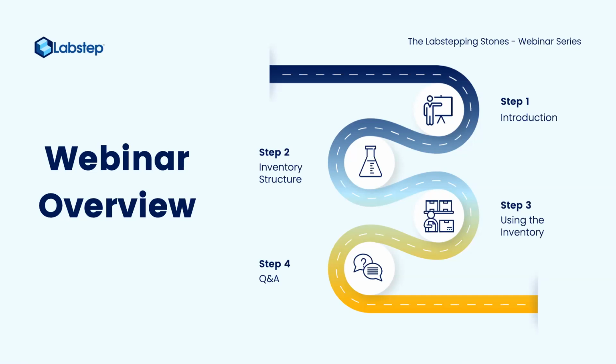I will run through all of this with examples using coffee ingredients, but I will also discuss how the content relates to other users of Labstep that were given as examples by our customers. The webinar itself will last about 25 minutes, so we can then leave the 5 minutes at the end for the questions. You can use the chat at any time for questions and Eloise will answer you. Okay, so let's get started and dive into the inventory module.